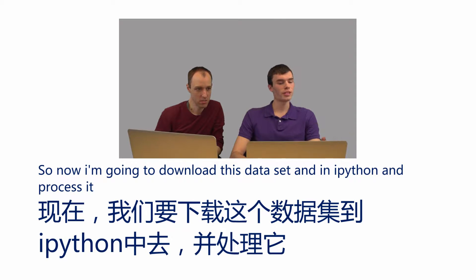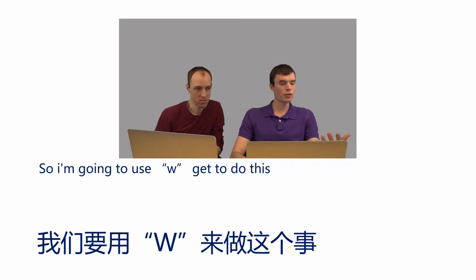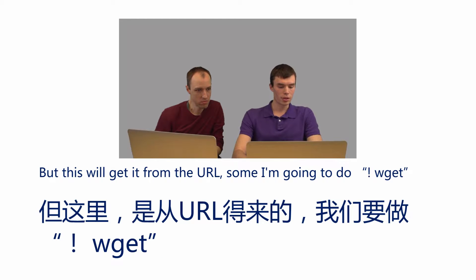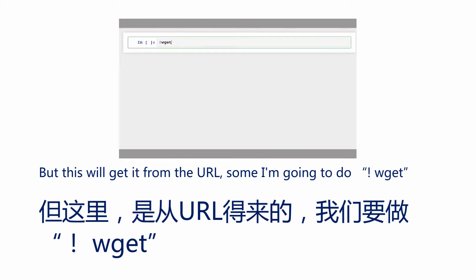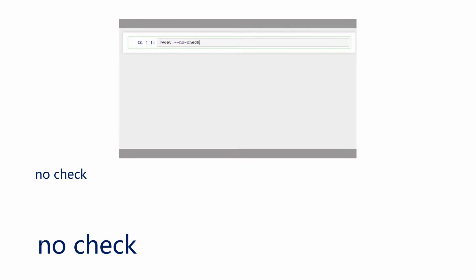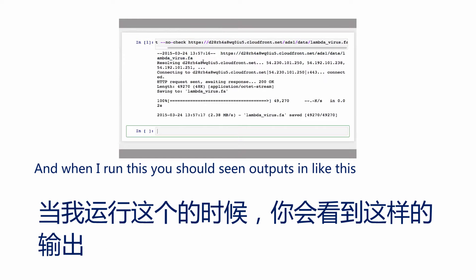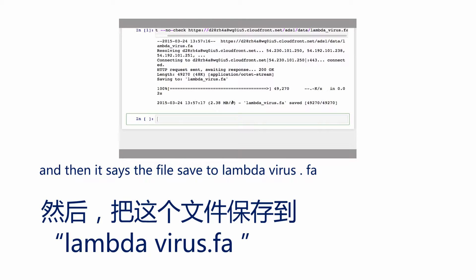Now I'm going to download this dataset in IPython and process it. I'm going to use wget to do this. If you have the file downloaded, you can also just open it locally, but this will get it from the URL. I'm going to run exclamation mark wget, and then paste in the URL to the dataset. When I run this, you should see an output something like this, and then it says the file is saved to lambda_virus.fa.